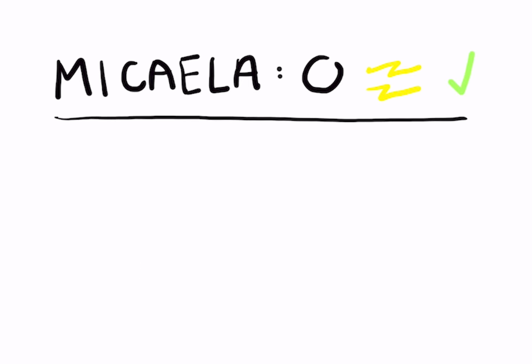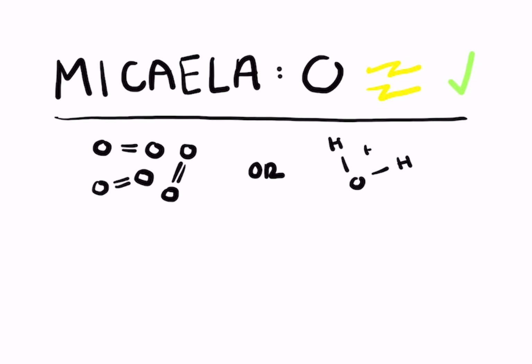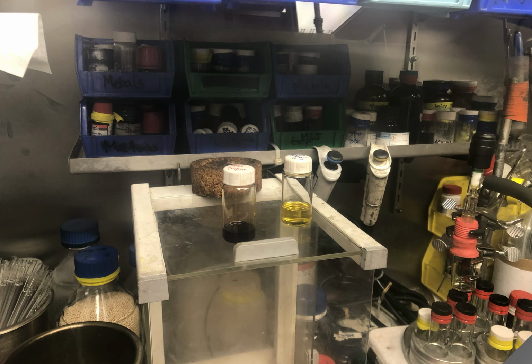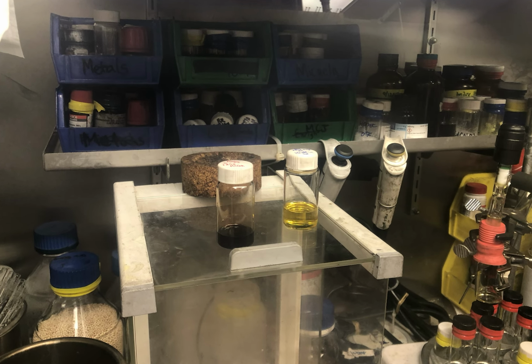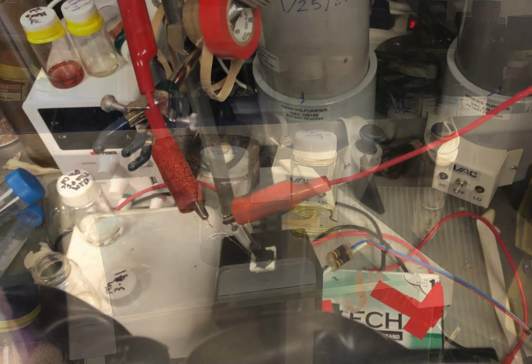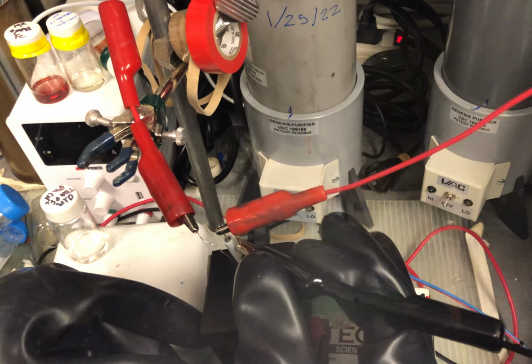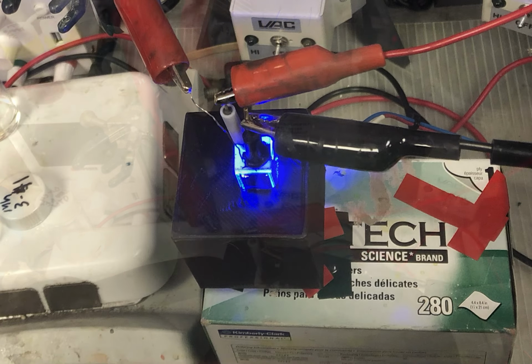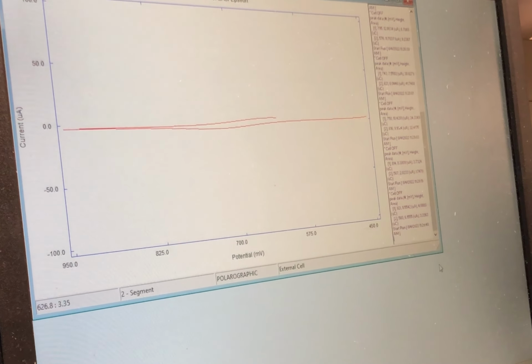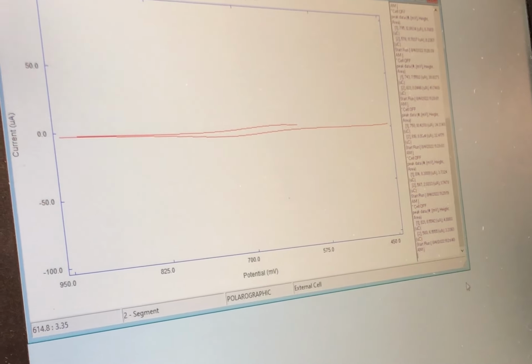The Cossairt Lab works with materials which are very oxygen sensitive, and many of which are pyrophoric, meaning they can suddenly ignite if they are exposed to air or moisture. Because of this, many precautions need to be taken. Michaela puts the quantum dots in a specialized glove box, which contains no air or moisture, and then takes a cyclic voltammetry measurement when they are in the dark and when an LED is shown on them. From this measurement, she can determine how quickly light energy is converted to chemical energy.